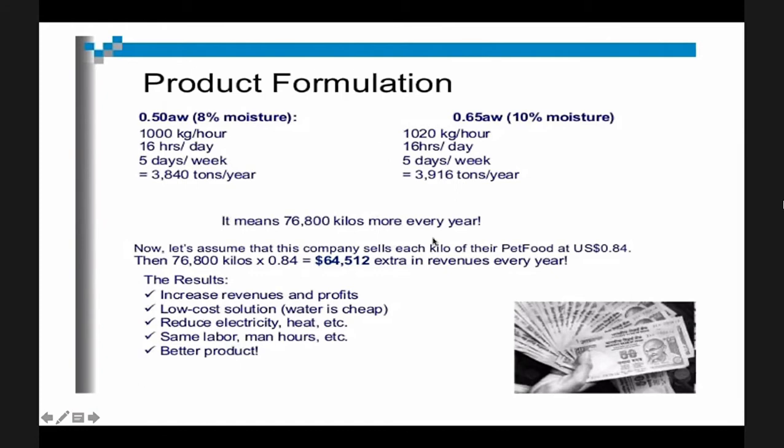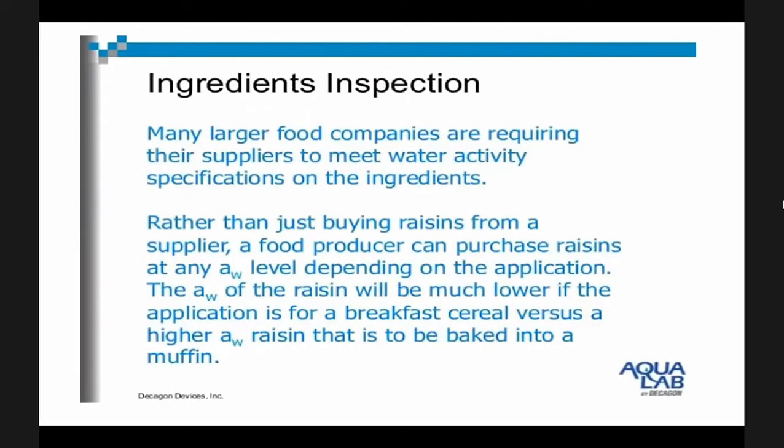Okay? So, knowing already, no, ang importance ng water activity, but later, may mga bakery na kamo. So, you can also use this one to determine cost-wise, no, ang mga formulation. Okay, another one, water activity is also a criteria in inspecting raw materials and ingredients. Okay, so we're done.